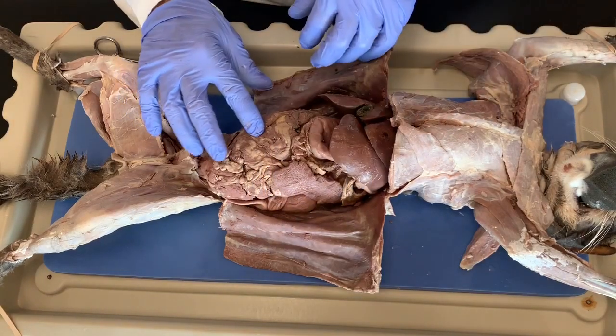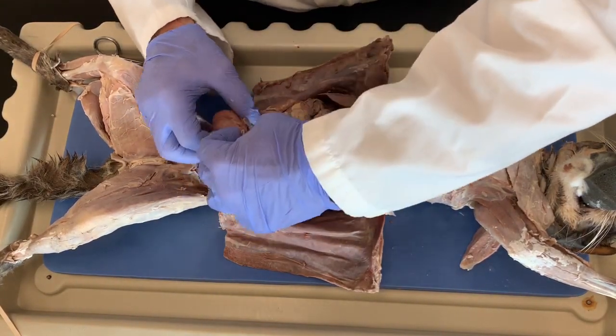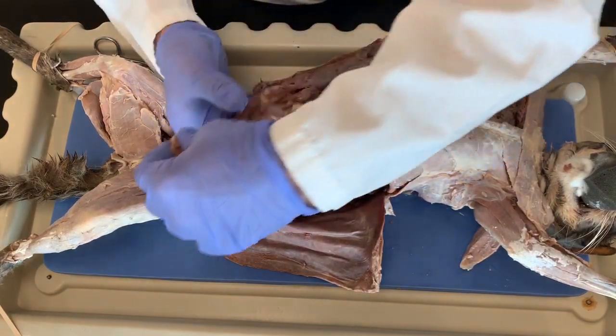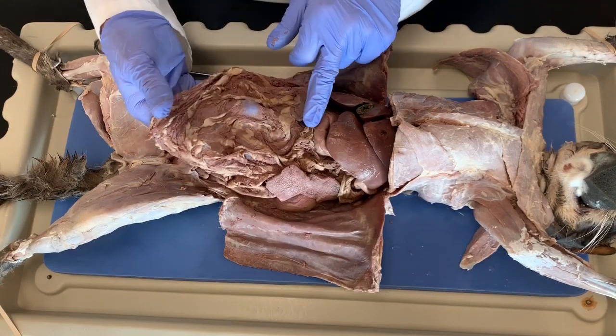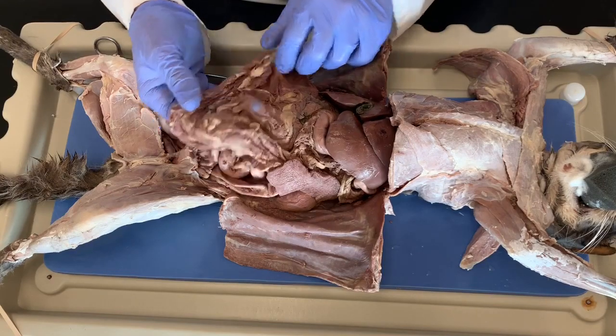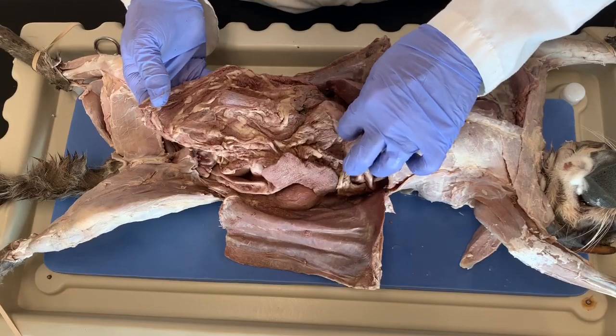And it looks like this is the intestines, but it's not. So it's a blanket, and as we separate it, you can see the intestines underneath. So again, this contains fat and loose connective tissue, and it acts as insulation and protection in the abdominal cavity, and it's adhered to the bottom of the stomach, okay?